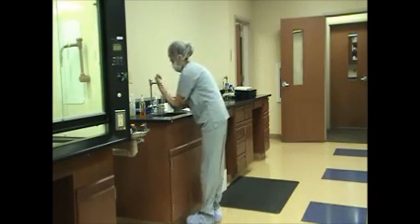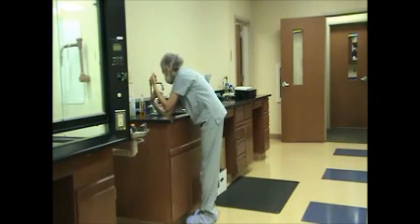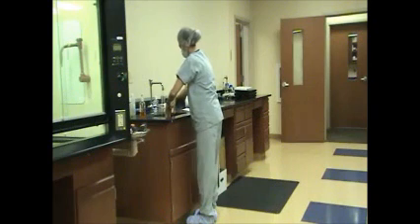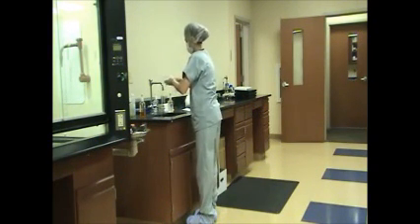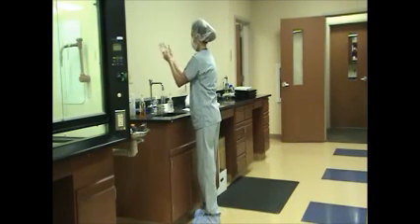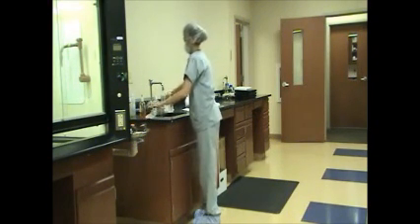Rinses hands and forearms, holding them upright, allowing water to drain from hand to elbow. Dries hands and forearms using a towel or hand dryer. Turns water off with a clean, dry towel.